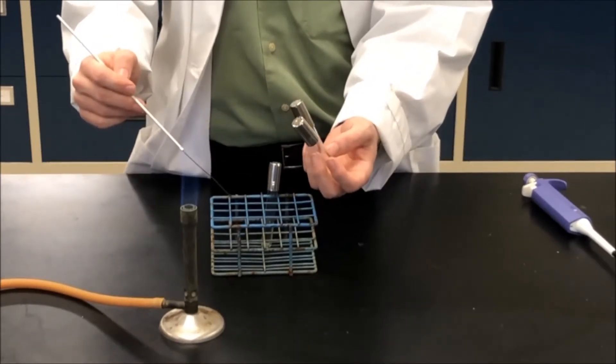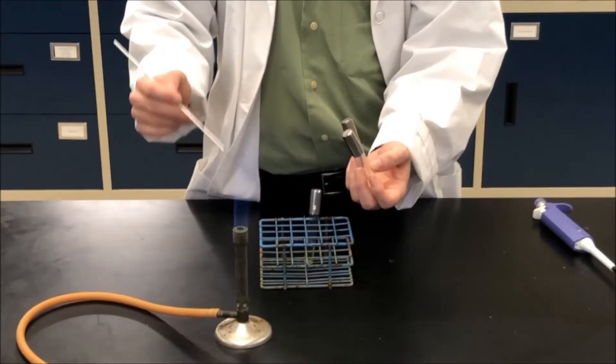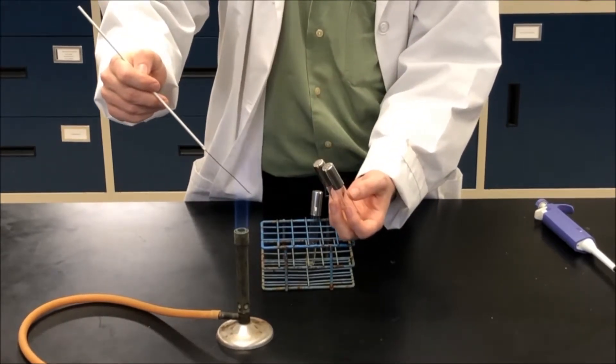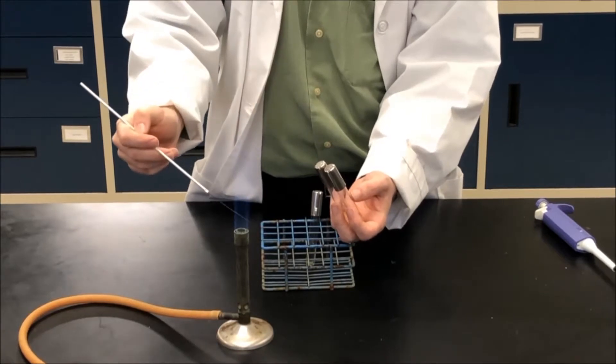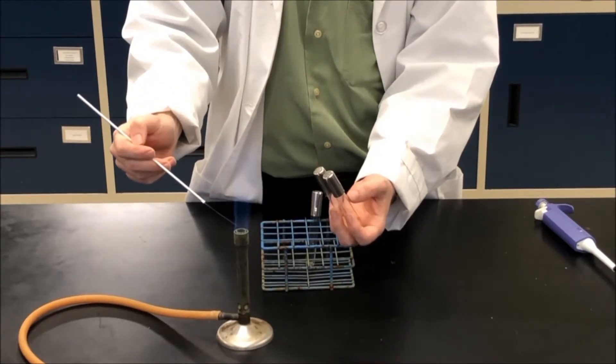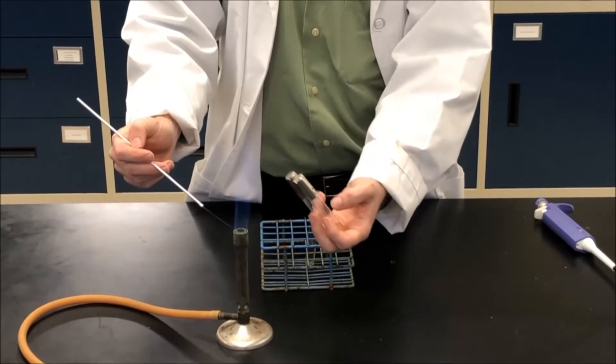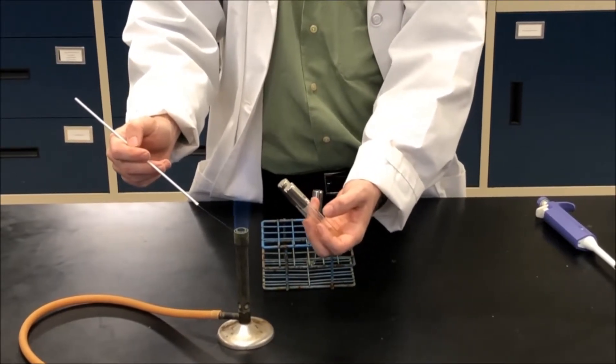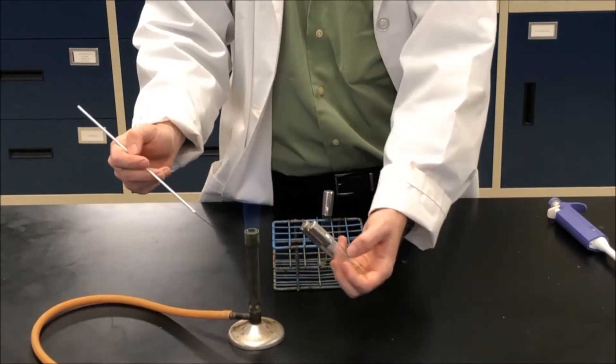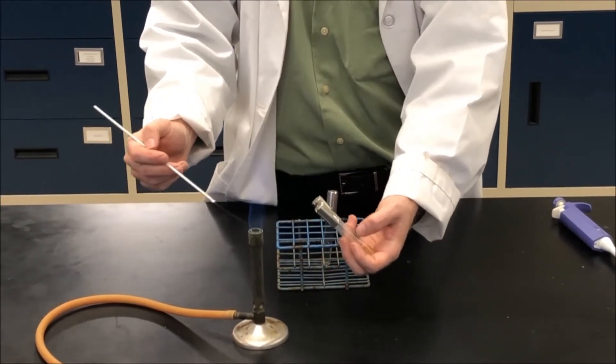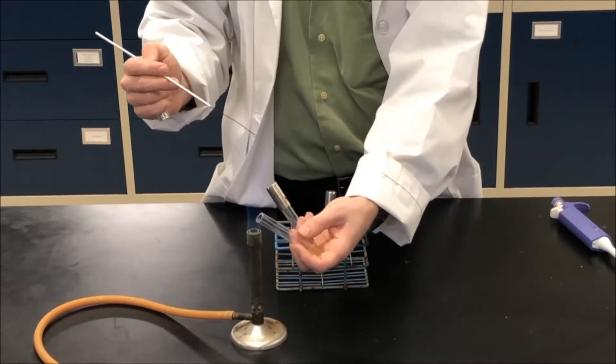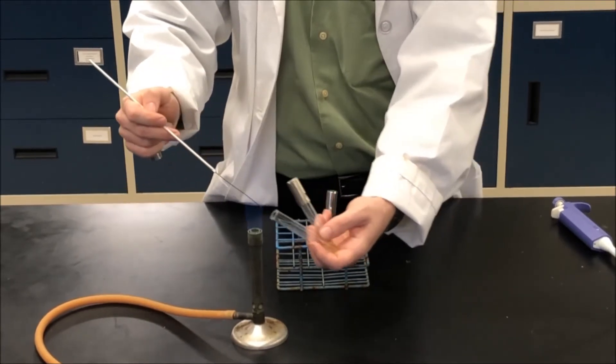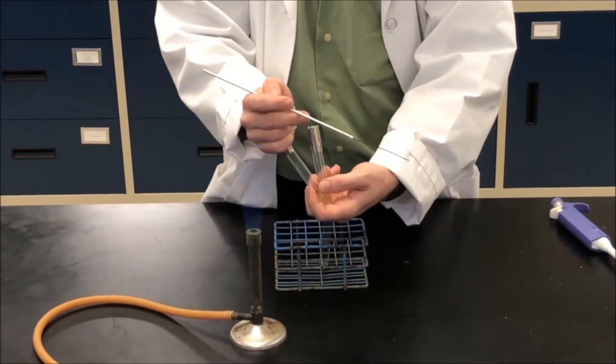We'll do that one more time. So we flame my loop, allow it to cool. Notice that I'm always staying as close as possible to the Bunsen burner because of aseptic technique. So this around my Bunsen burner is going to be my sterile field. Open up the bacteria culture, flame, get a sample, flame, close.